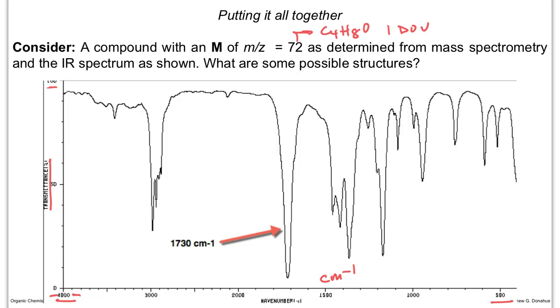We're not going to talk too much about, do you remember Beer's law from Gen Chem? A little bit. So there are two terms, transmittance and absorbance. They're inverse to one another. I don't have my fancy laser pointer, but I have this cat-chasing red one that barely works. So I'm pushing that button, right?